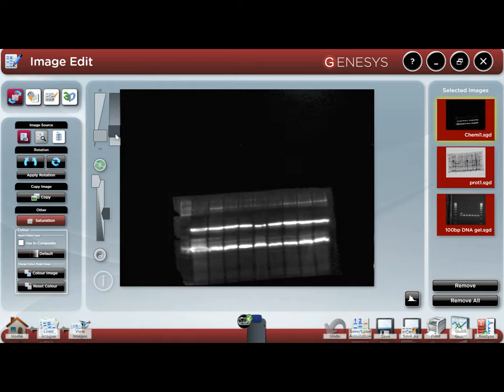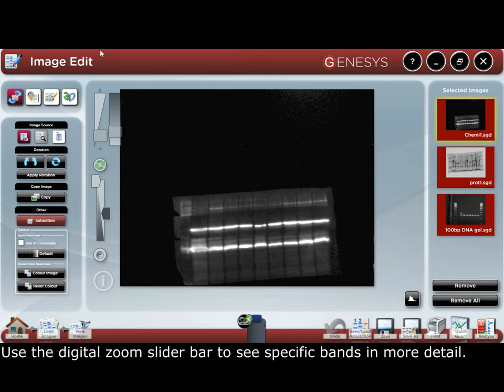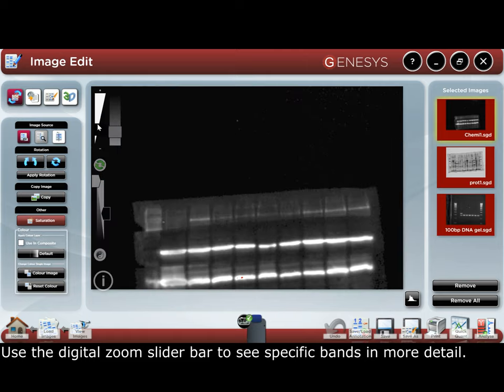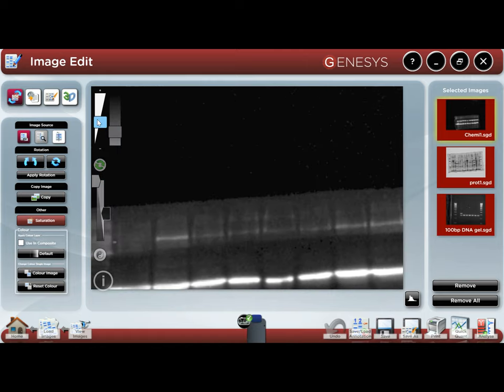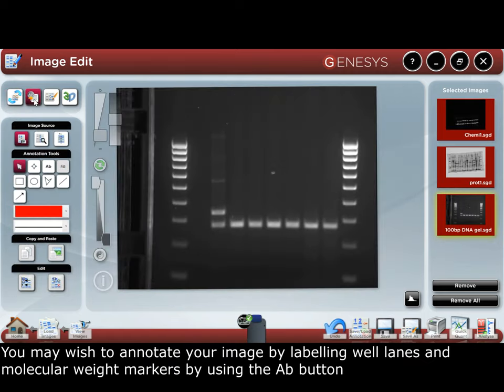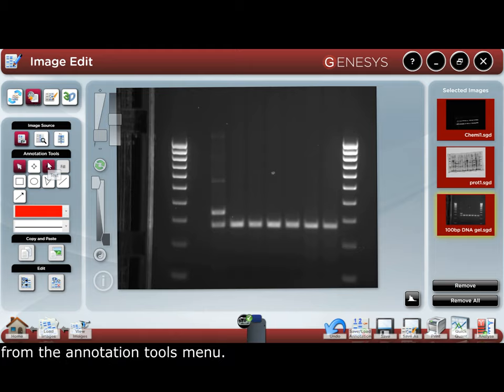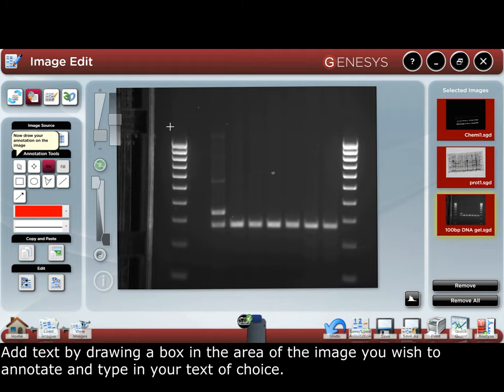Use the digital zoom slider bar to see specific bands in more detail. You may wish to annotate your image by labeling well lanes and molecular weight markers by using the AB button in the annotation tools menu. Add text by drawing a box in the area of the image you wish to annotate and type in the text of your choice.